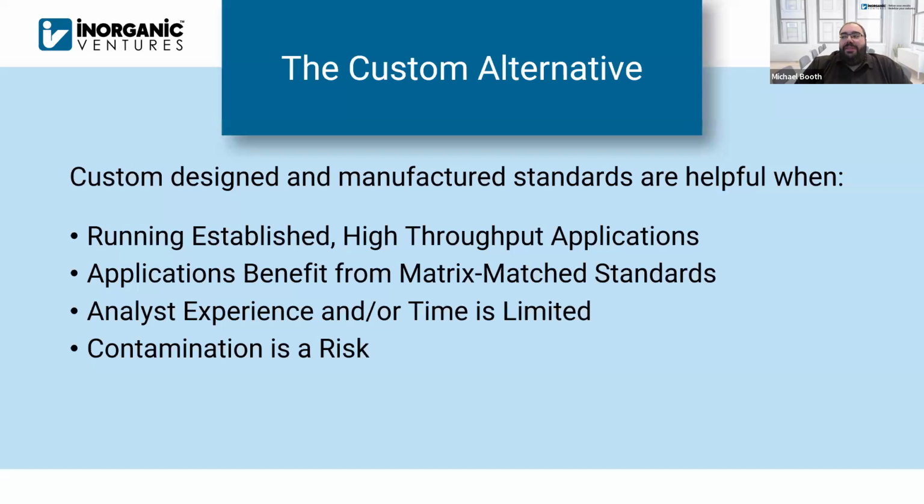Sergey also mentioned matrix matched standards, and this is also extremely important. And this is where custom standards can come into play. We can essentially put together standards that are matrix matched to these high concentration elements that might be in your matrix, and we can ensure that those standards are also clean of impurities. So that's really the biggest part. We've talked to a lot of folks that have put together matrix matched standards from stock standards, and they're using maybe a salt or something like that to do the matrix matching.